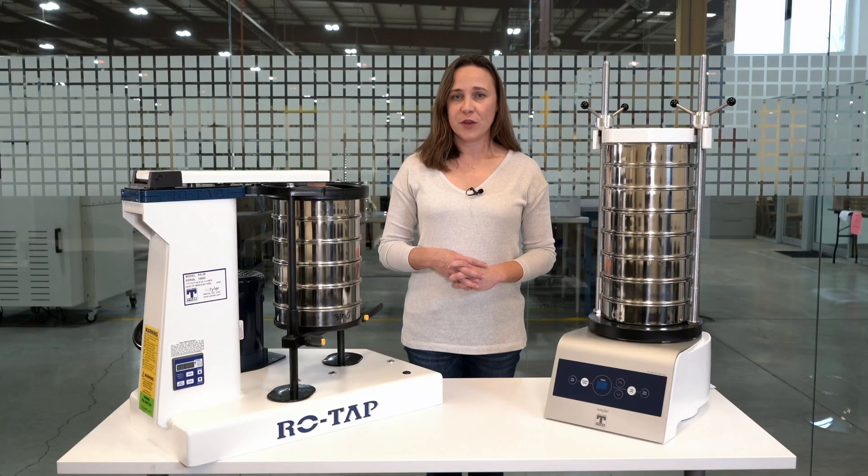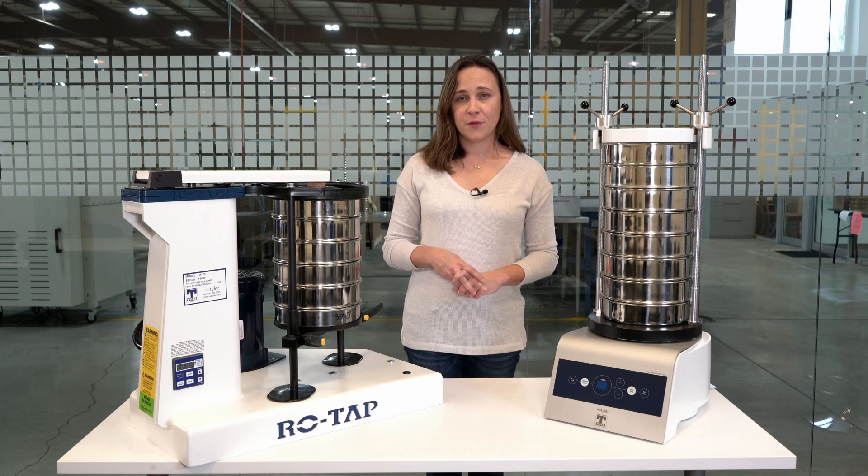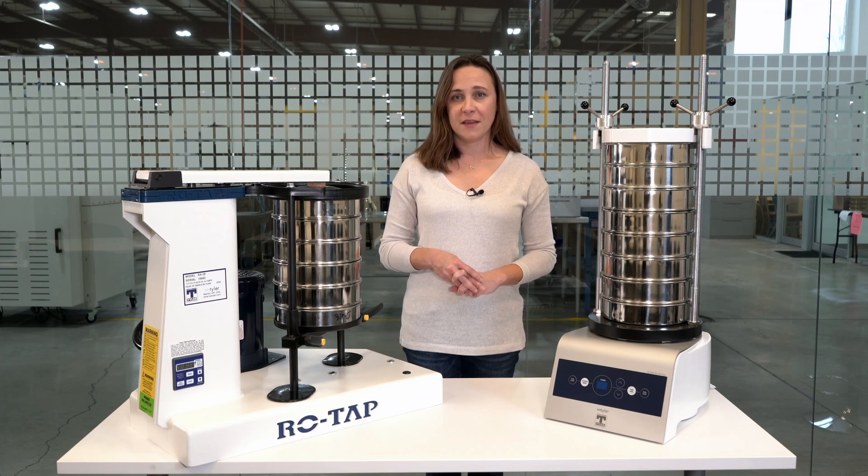So you're looking for a sieve shaker and aren't sure which one is the right one for you? Or perhaps you're looking to update your current lab setup. In this video we'll talk to you about the two different sieve shakers that WS Tyler offers: the original mechanical ROTAP and the newer ROTAP-E, and explain the pros and cons of each.